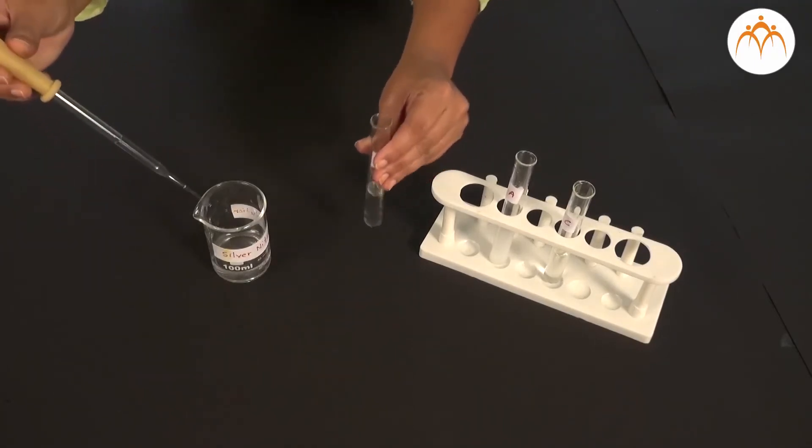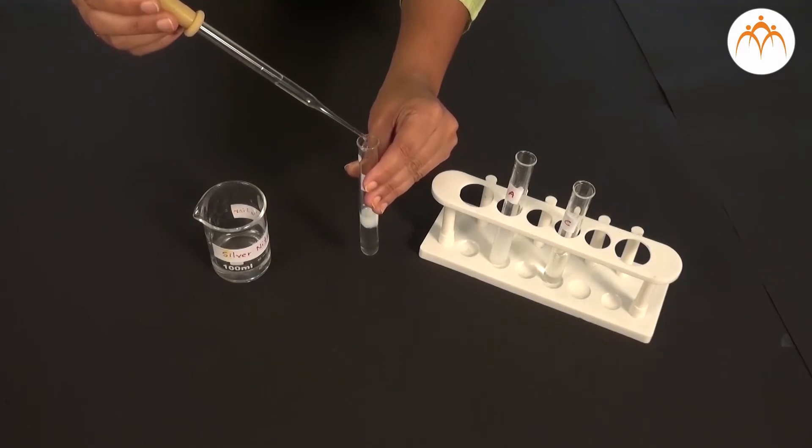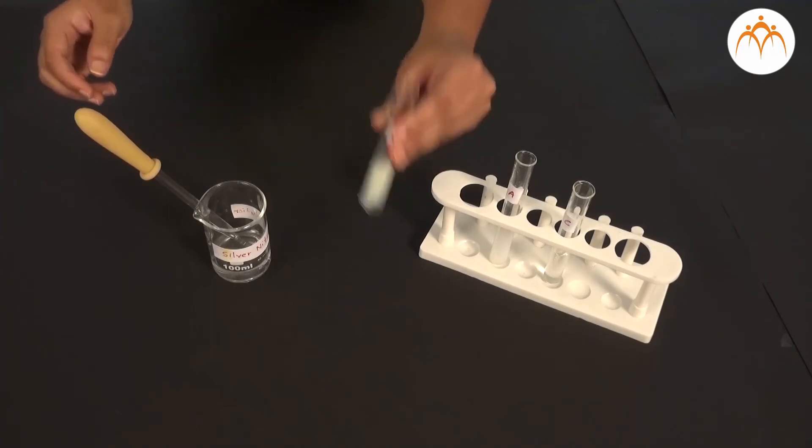In all three test tubes you will find precipitates. It means that when silver nitrate reacts with these three compounds or solutions, precipitate is formed.